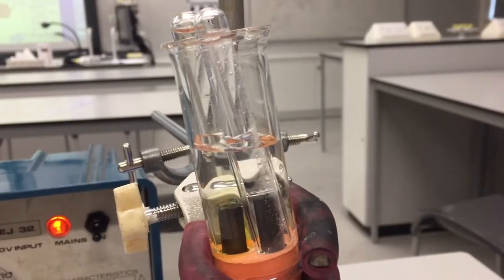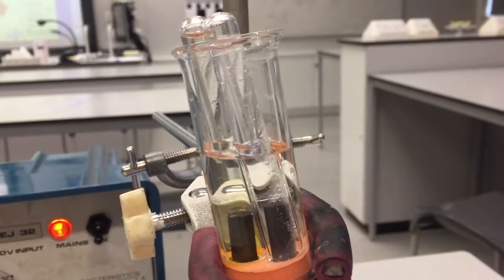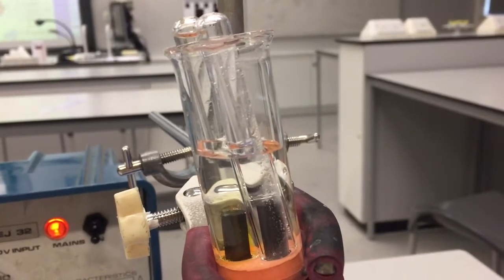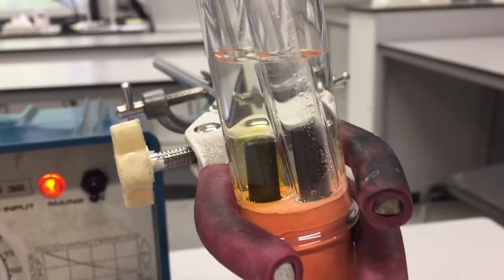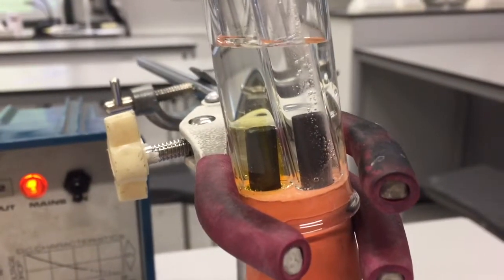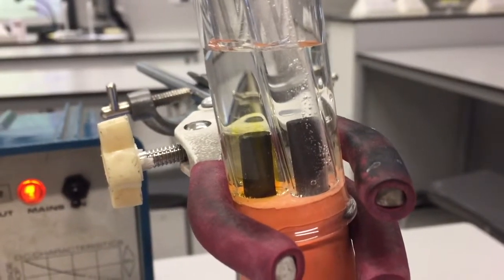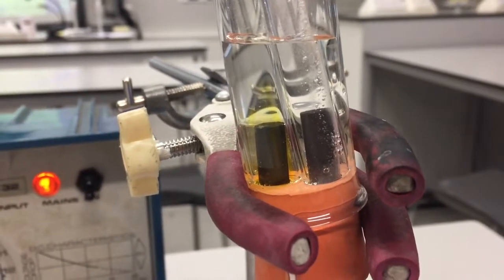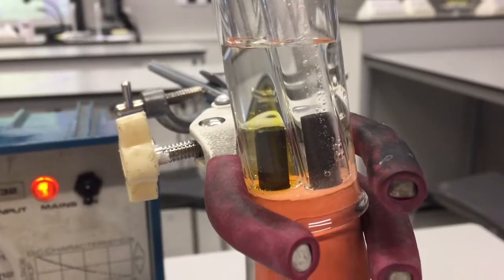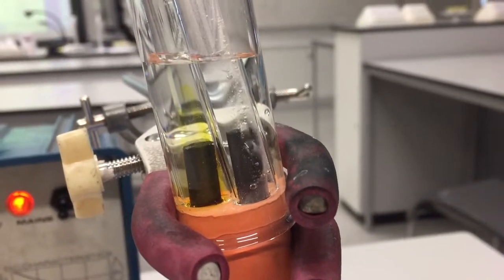Key things there for the exam question: you have to say lighted splint, you can't say lighted match, and you have to say ignite with a squeaky pop, and it has to be squeaky pop. Keywords. Now you can notice on the anode, the positive electrode here, that we're getting this brownish tinge from the bromine, which is forming and then dissolving into the water to form this brownish colour. We're getting bromine because bromine is a halogen, and if you have halogen ions in solution, the halogen will always be produced. But we're not getting potassium because potassium is more reactive than hydrogen.